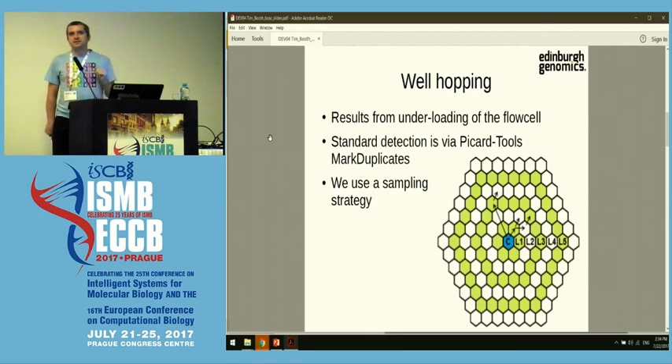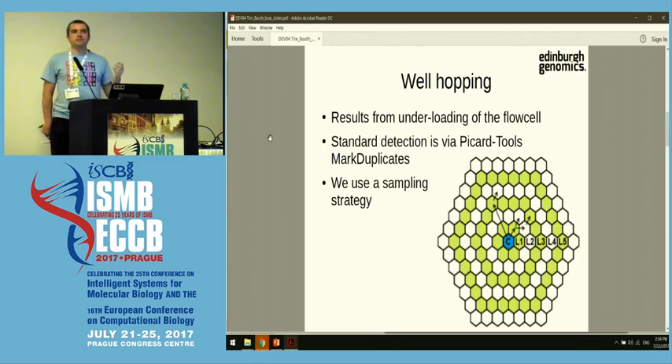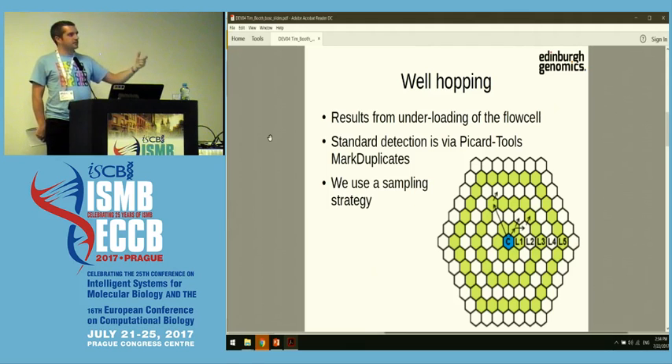There's a standard way of detecting this by aligning your reads to the genome, and then further down the line, Picard tools will tell you how many optical duplicates it thinks you have. The problem with this is although it's very robust, it's not very fast. And of course, you need to have the FastQ files and you need to have a reference genome that you are able to reliably align them to in order to get this result. So we wanted something a bit quicker, maybe a little bit dirtier, but quick and able to work for any type of DNA without a reference.